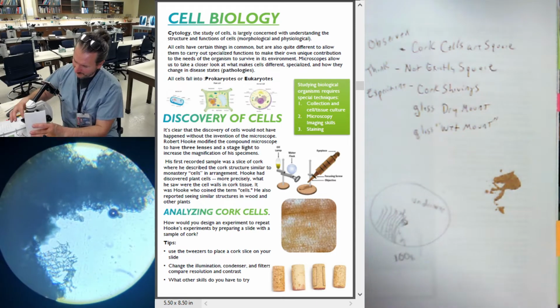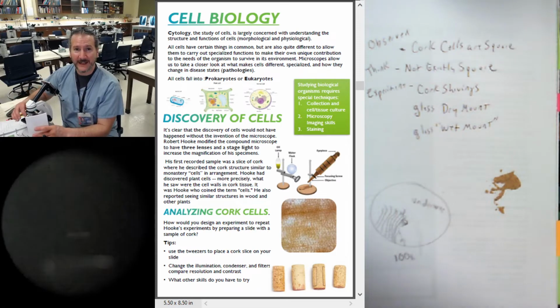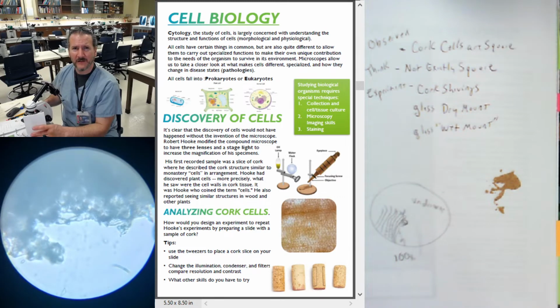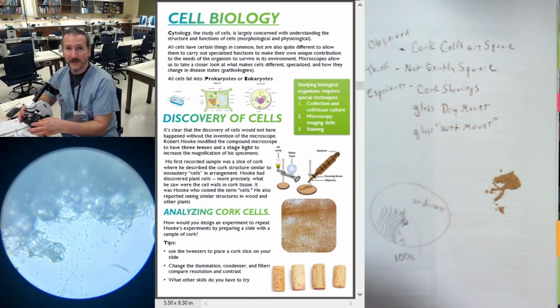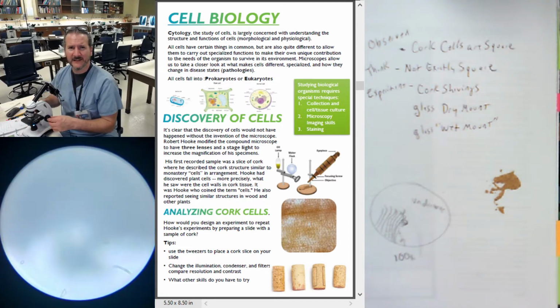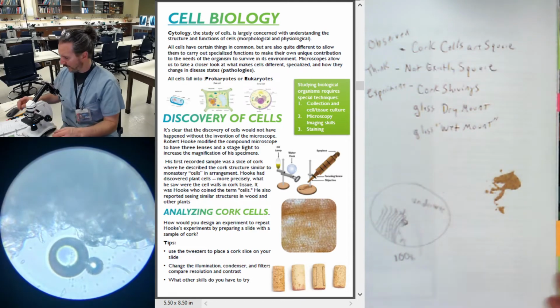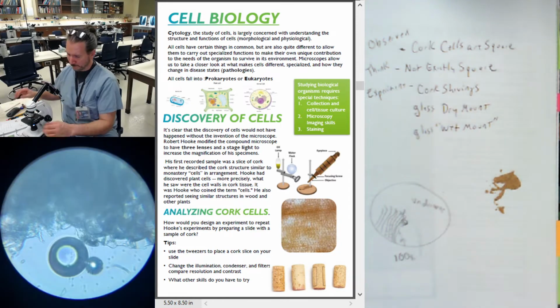And now I'm going to go up to the highest objective. I really want to try and see that little, it's almost like an island, you know? Oh, did we get right there at the air bubble again? So we knew the air bubble was up. Let's see. Oh yeah, that's an air bubble right there. Snap a picture, quick. Air bubble. I'll take it.